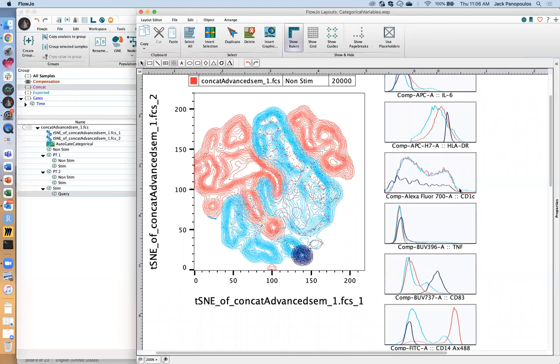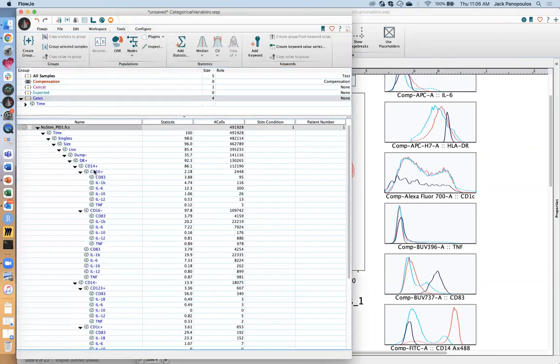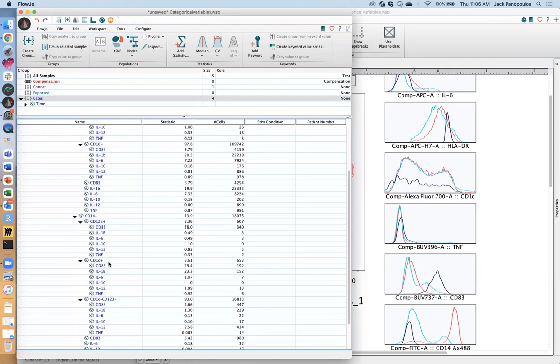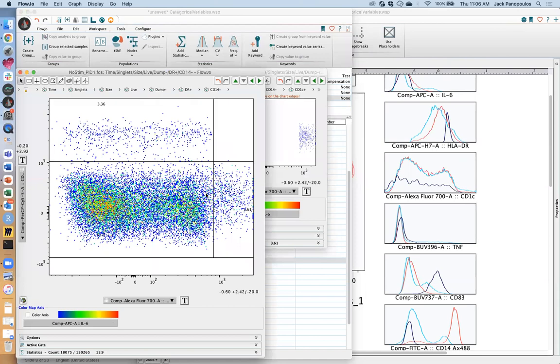This little tail here, these are probably the true positives, and these two distributions here correspond to this sort of bubble population that you see. Let's go back to this graph real quick. If we look here, you see how there's kind of these two lobes. Those are going to be these two distributions. This little guy over here, what they were considering positive, is this stuff over here.